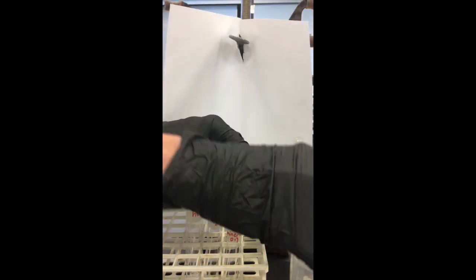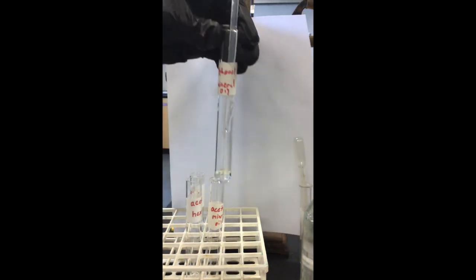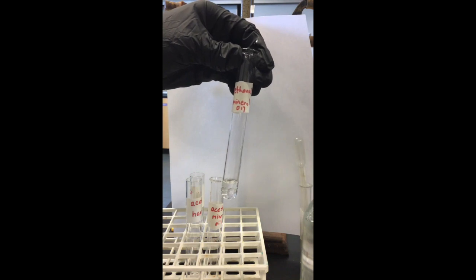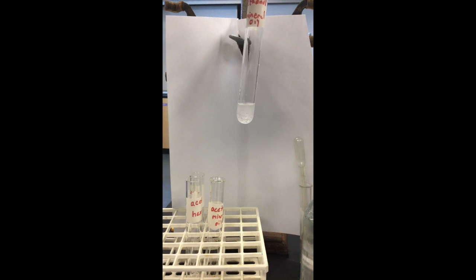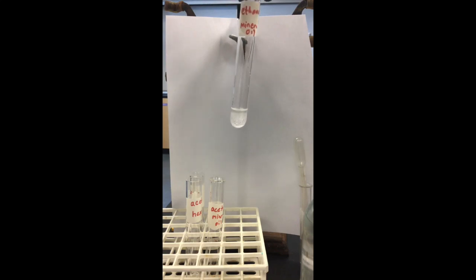Then we have mineral oil and ethanol. For this one, we may want to let it sit for a little bit. See if we can tell if it's forming two layers or not.